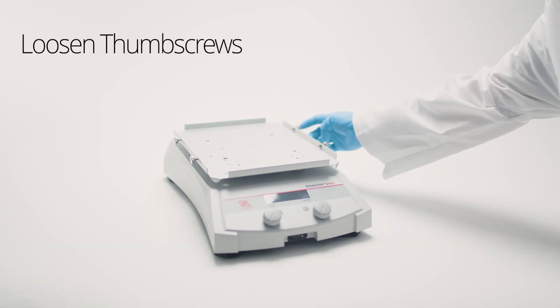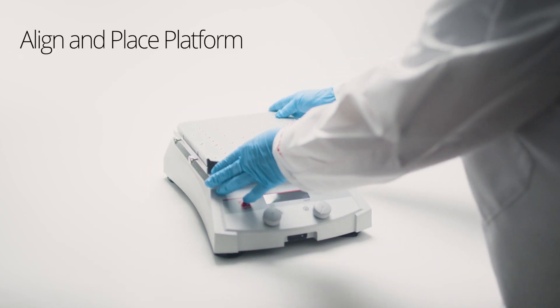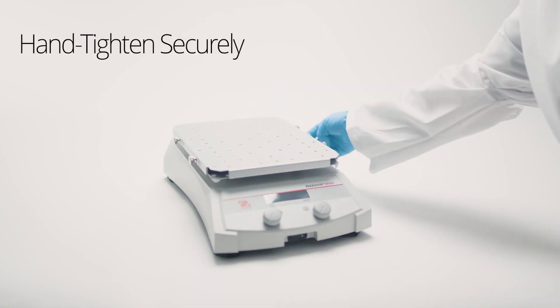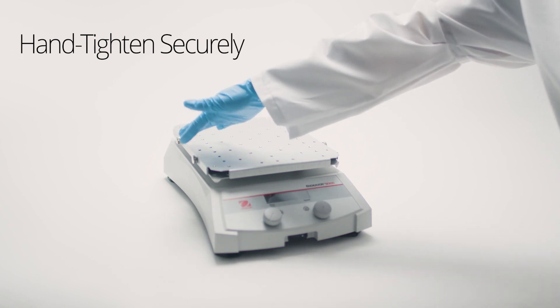Loosen the four thumbscrews on the shake tray. Align the platform slots with the thumbscrews and let it rest on them. Tighten the four thumbscrews without overdoing it. This unlocks a whole range of configurations.